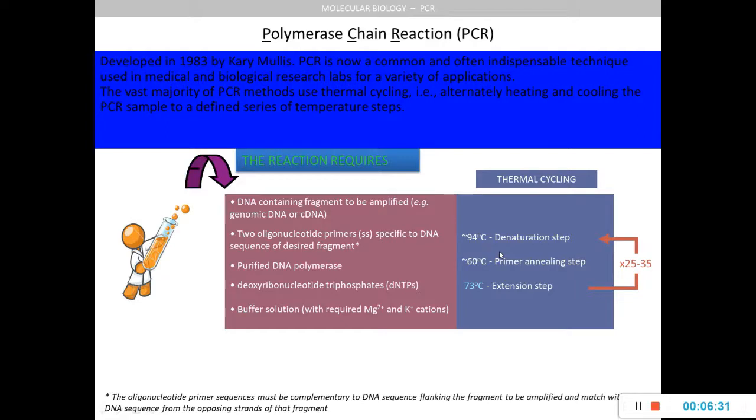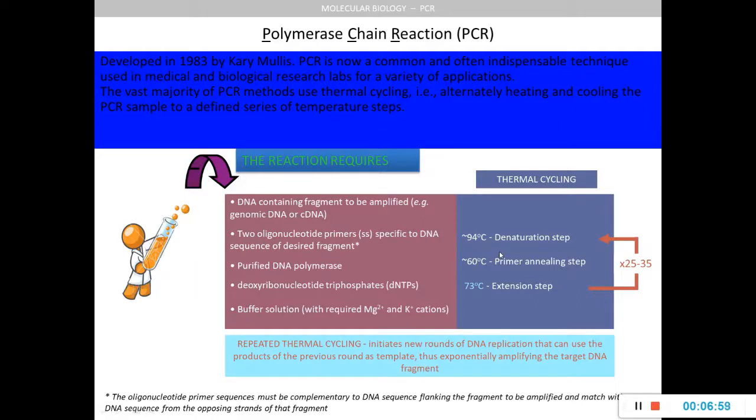Or many copies of that will be made during the PCR reaction, so that it becomes detectable for you within a period of about 2 hours or maximum 3 hours, depending upon those. Some PCR machines even give you the result in 1.5 hours. So the reaction time depends upon the machine that you use, as well as the primer which you have given, as well as the reaction mixture. So let's go and see how this happens.